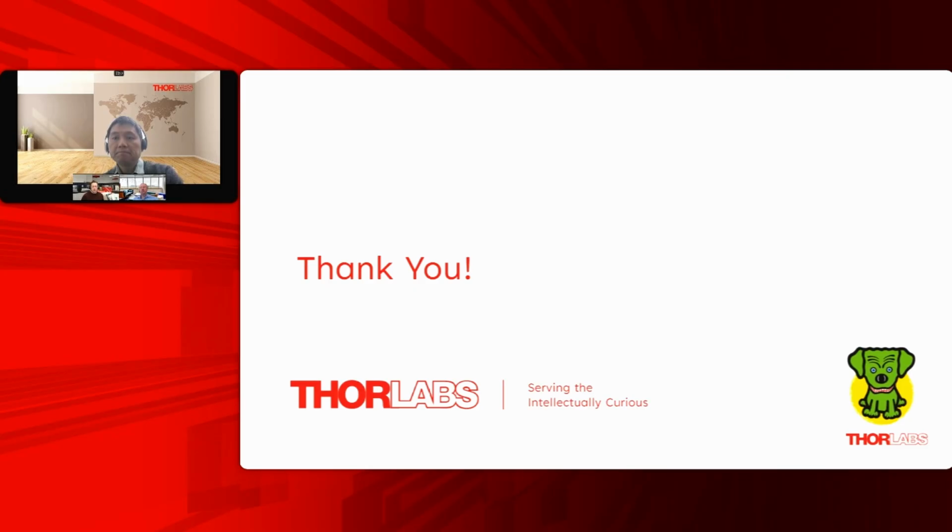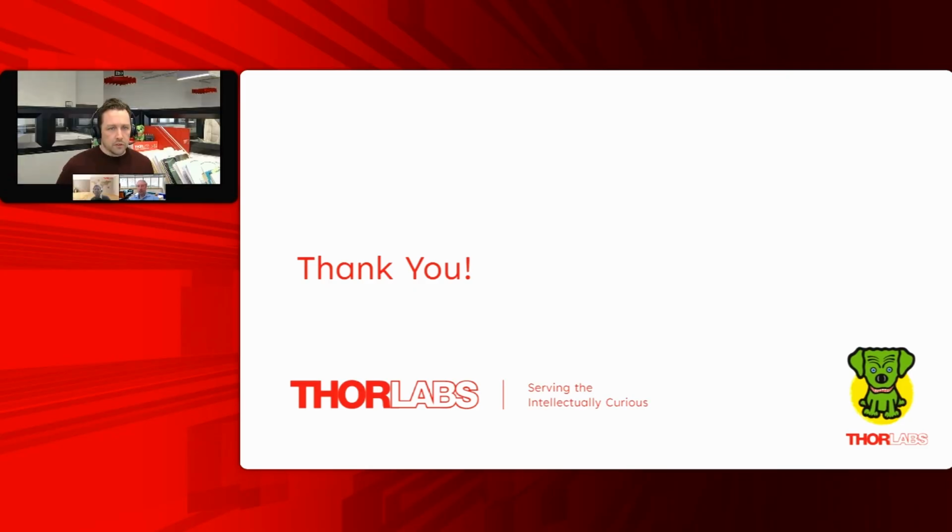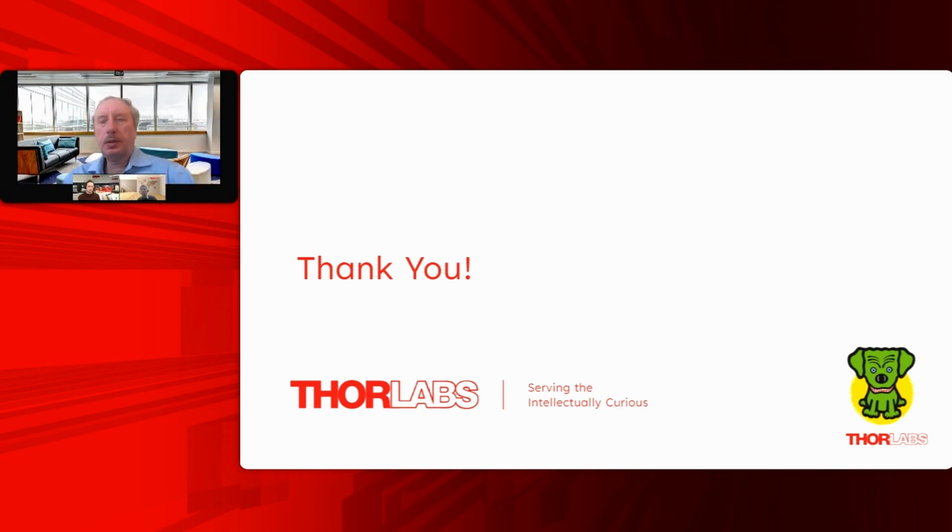Sergey, back to you. You had given an example of tissue imaging. Can you expand a little bit about the requirements of tissue imaging, specifically the spectral resolution that might be typical for an application like that? The requirements of spectral resolution. Okay. Typically, 4 wavenumber resolution is good enough for all condensed matter measurements. So 4 wavenumbers is very standard for such measurements. Thank you.